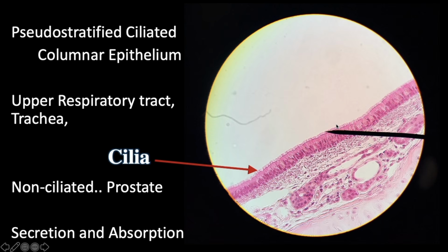Then as it comes up, you don't feel the cilia moving, it just happens. And then when you get enough mucus, what do you do? You swallow, it goes down the esophagus, down to the acidic stomach, and kills any pathogens that have been trapped in the mucus. It's called a mucus escalator.